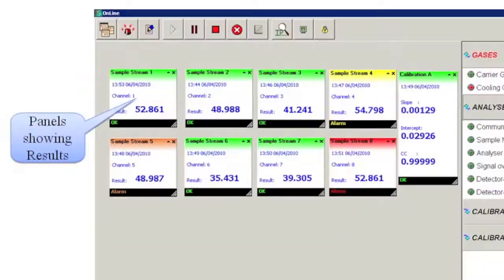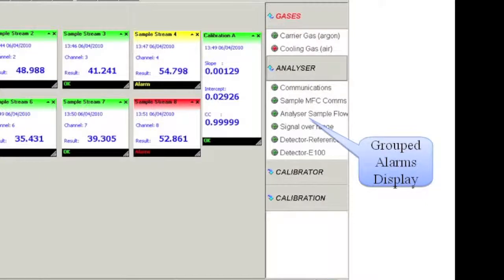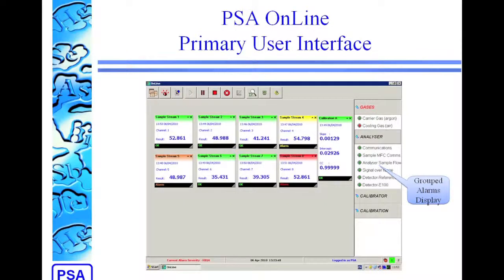We then have a user-definable area, where we can show the results for each of the different channels. We can set up the names, and we can also show calibrations here. The last thing we have on this page is the grouped alarm display down the side, where all of the different alarms that are set up for the system can be shown in different groups, and you can expand or contract the groups to see the detail of them as required.